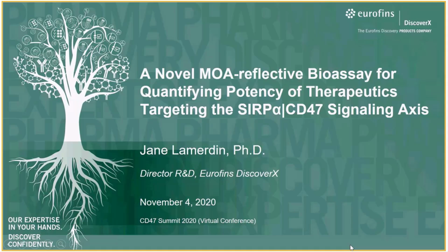Thank you for this opportunity to speak with you today about our novel MOA reflective bioassay for quantifying potency of therapeutics targeting the SIRP-alpha CD47 signaling axis.